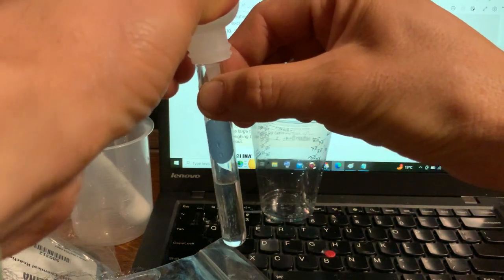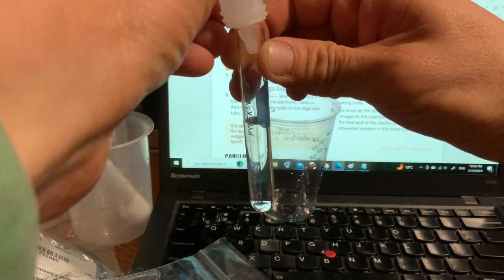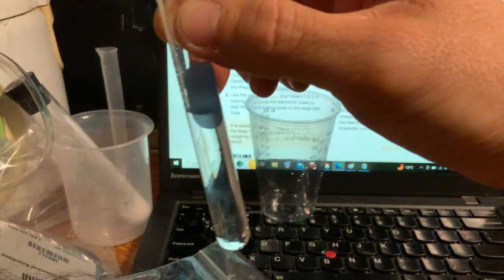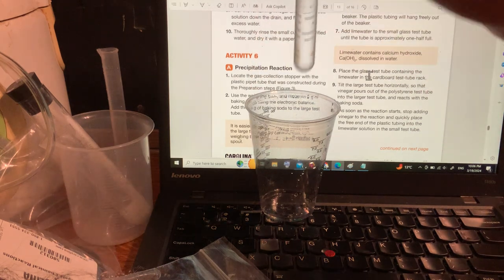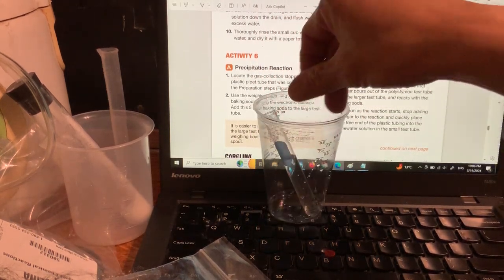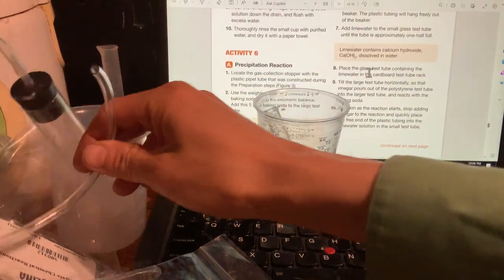The fact that I have drops of water in here is not good. It's better if this test tube were dry, but it's not critical. If this is going to work, it should still work, even though I had drops of water in here. Having drops of water in there dilutes the calcium hydroxide, so it's not exactly lime water anymore. It's not saturated, but it's okay. I hope it's going to be okay. So let's see. Let's do this. So this is what you do.